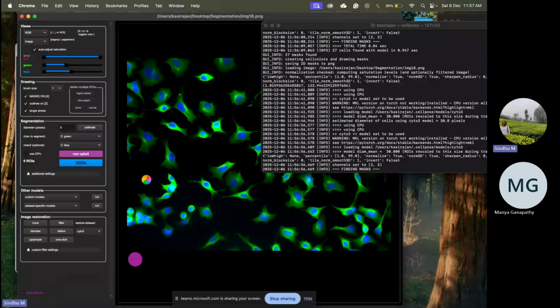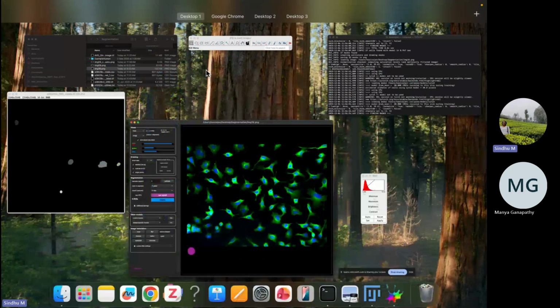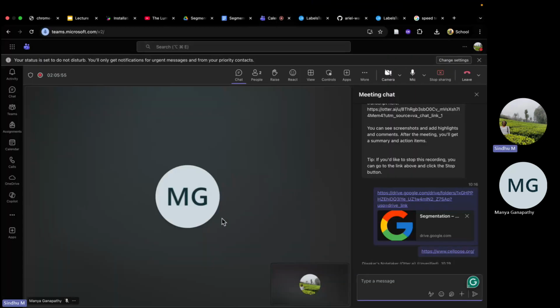And I hope you can still see my screen and everything. Yeah, it's still being shared. Okay, great.